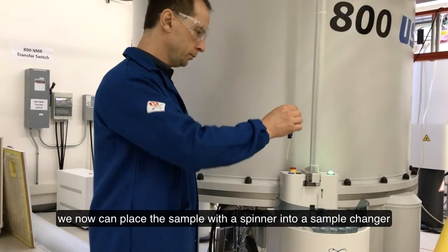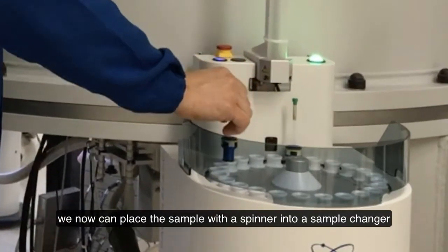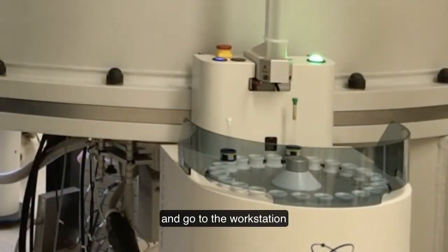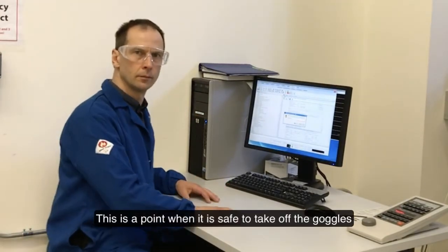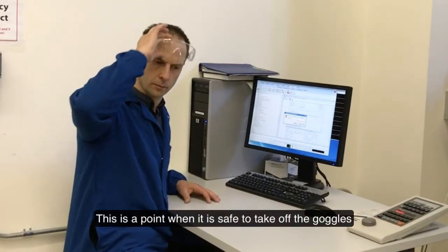All is good. We can now place the sample with the spinner into the sample changer and go to the workstation. This is the point when it is safe to take off the goggles.